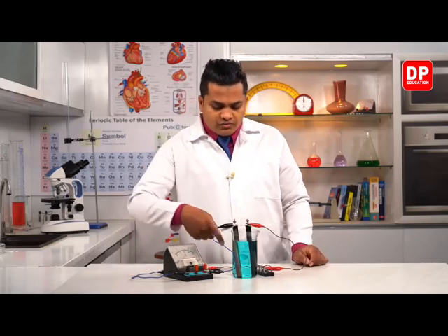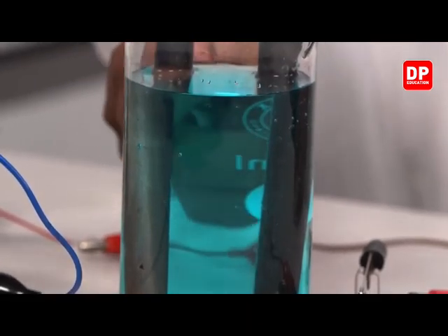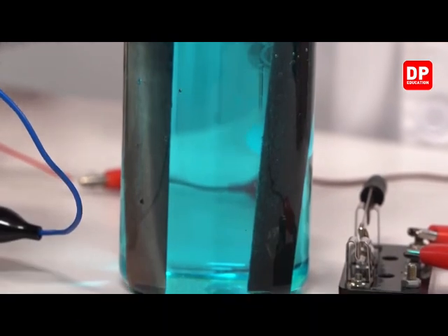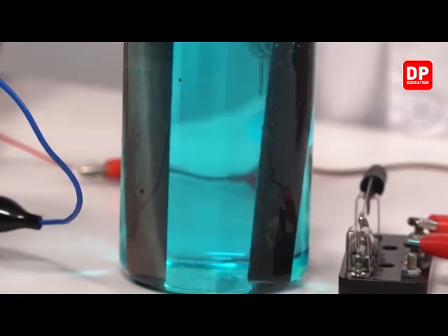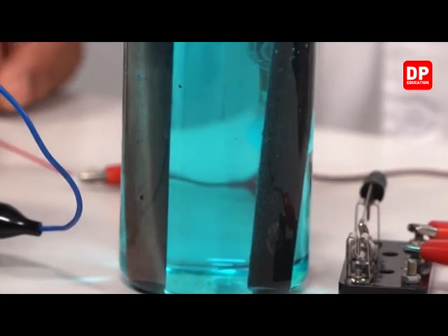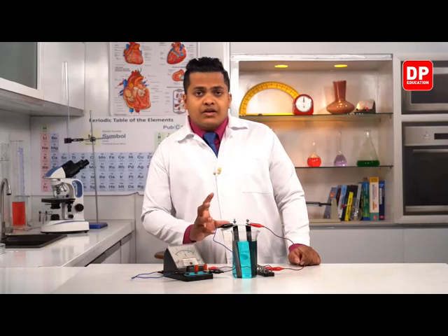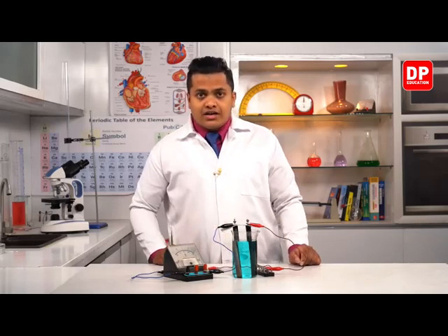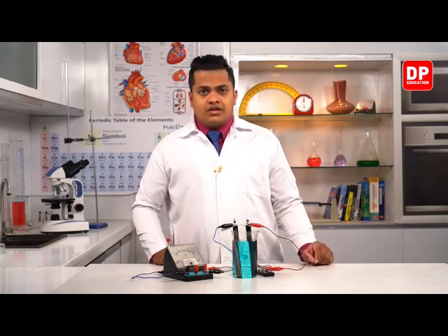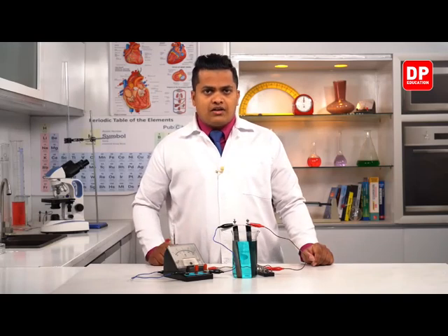However, now you can observe there is a copper color deposition around the carbon rod. In the previous instance, you couldn't observe it because the copper sulfate was a dark blue color. But now it has dramatically changed. We can even observe a very clear copper nature on the negative terminal of the electrode. So there is a clear difference in the color. The color of the solution has been reduced. There is a clear reduction in the color, my dear children.